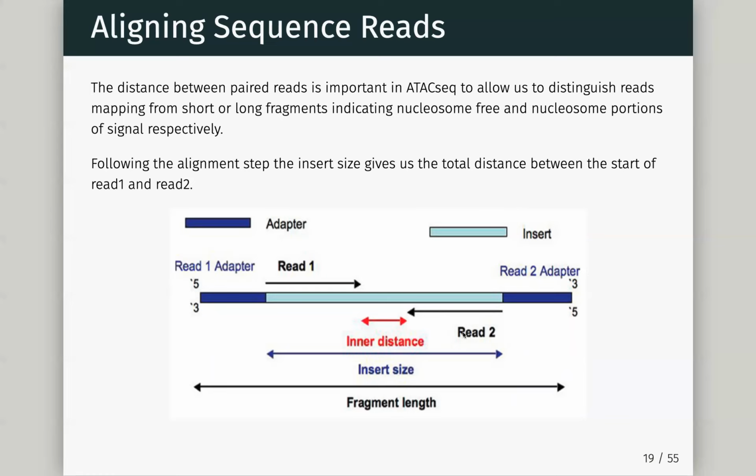But this gives us a lot of power in sequencing, because I can align this one, and then I can align this one separately. But then by knowing that they're from the same pair, there's an expected distance between them, right? Something between 0 and probably 3,000 or something. The distance between these two reads will also allow me to map better.